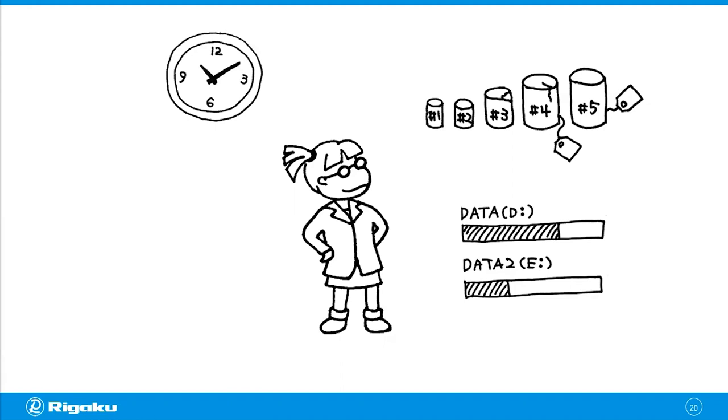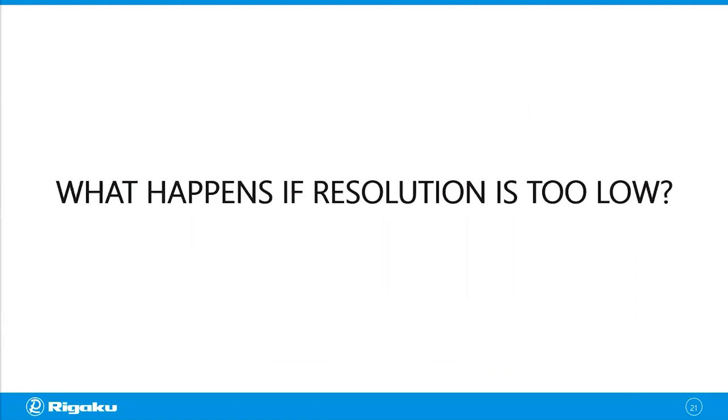And always, I'm thinking you should run a test scan before you commit to 20 or 30 hours of scans, so that you can get an idea of what kind of resolution and field of view you're going to need to do the quantitative analysis you're trying to do at the end of the day. Now, depending on the situation and all those parameters, there are times that you have to compromise on resolution. And when you do so, it's important to know what happens if the resolution is too low. I'm going to show you 2 examples where the resolution matters quite a bit.